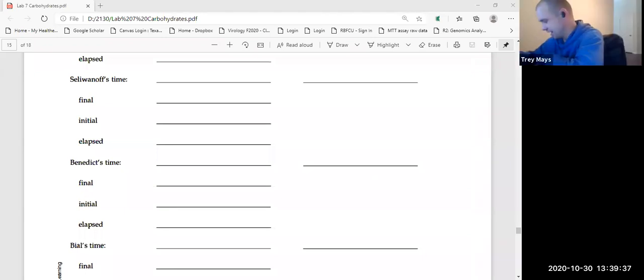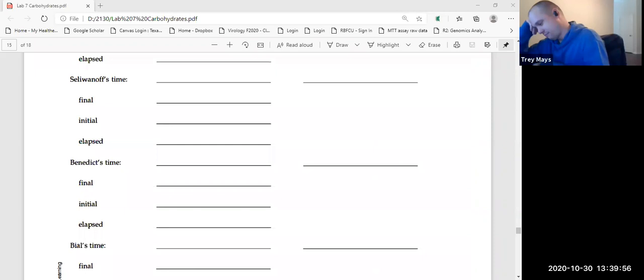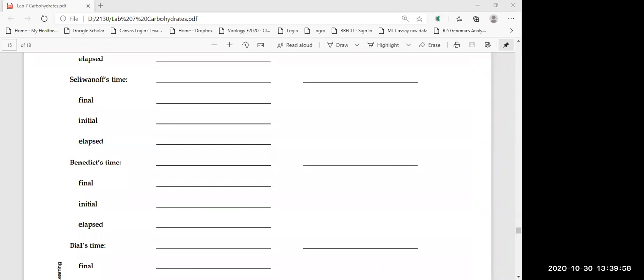I think you're actually right anyway, Flora. It reacts to change to either color depending on if it's ketose or aldose. Yeah, what I was trying to say is that we need a color regardless, whether it's an aldose or a ketose. Right. All we do know is that it's a reducing sugar, but they have different ones.